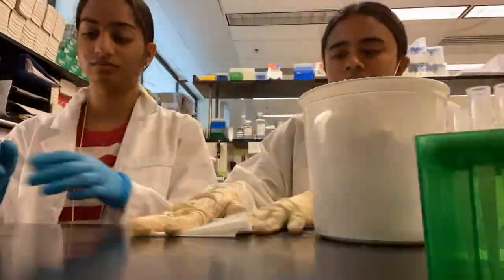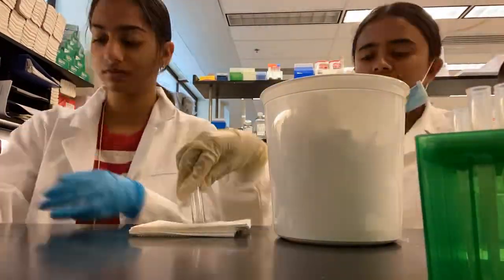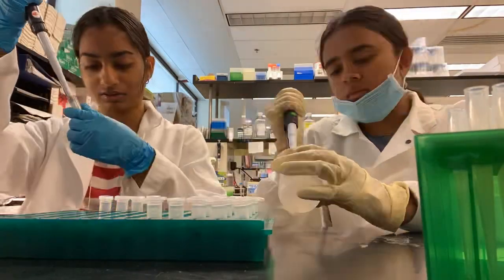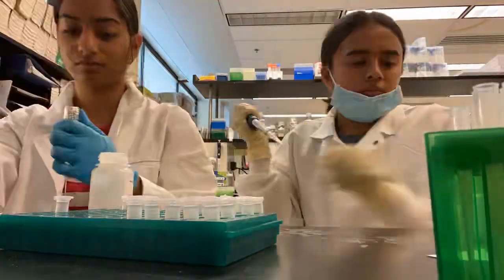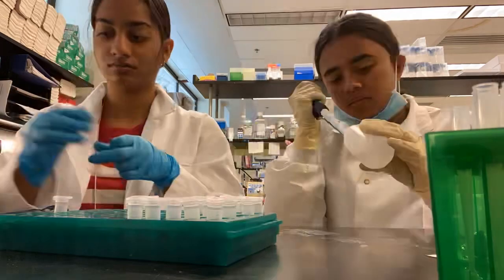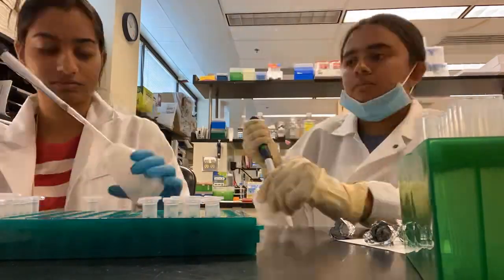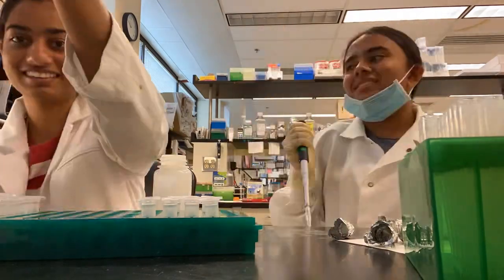Now we're going to start isolating our plasmids. Here we are combining different buffers with our bacteria to isolate the plasmid DNA. Later on, we will digest these plasmids to run a gel to see if the plasmids have the correct insert. If they do, we can use these plasmids for a number of things such as gel extraction, ligation, and sequencing.